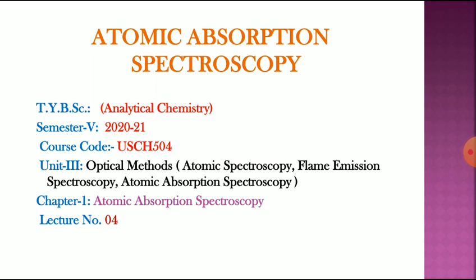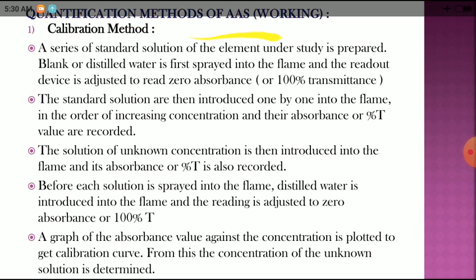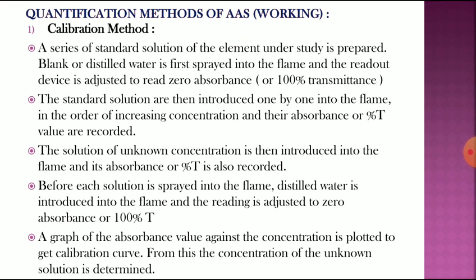Welcome to lecture number 4 on atomic absorption spectroscopy. Today we are going to start the quantification methods of AAS, or you can say the working of atomic absorption spectroscopy.